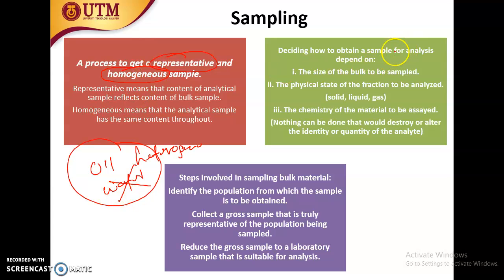You want to sample to a size that is suitable for you to bring back to the lab, and also you want to see what the chemistry of the material is, and also what the physical state is. Is it solid, liquid, gas? We will go into solid type later.